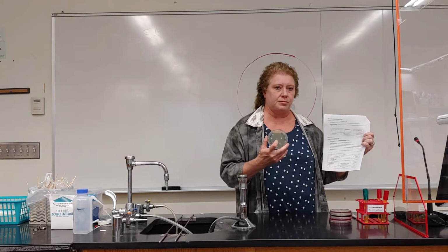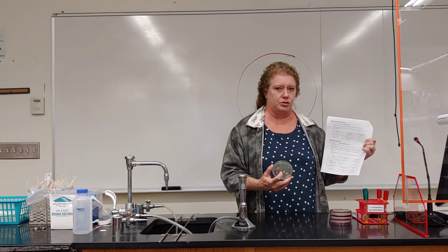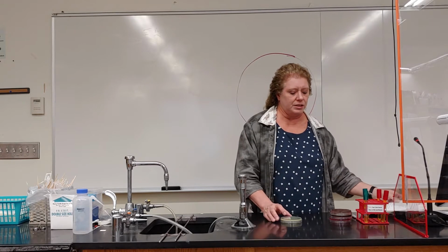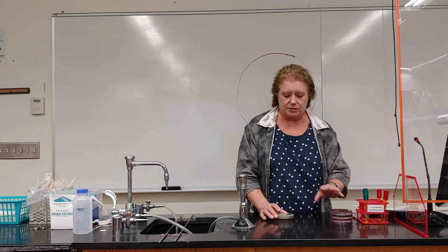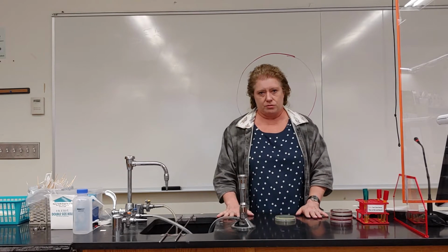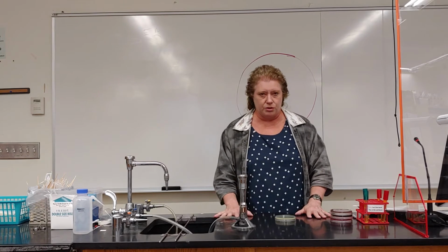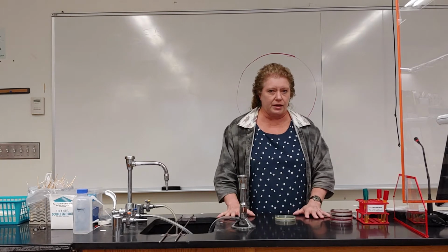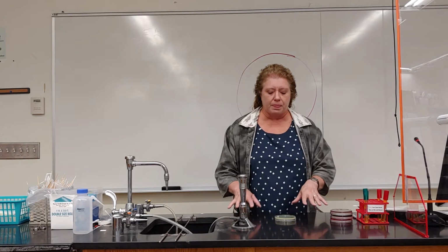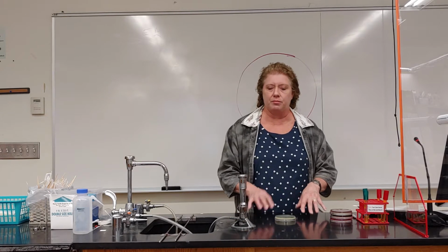This particular media is only selective. It is not selective and differential. So what does that mean? There are selective ingredients in all 4 of these media. The selective ingredient will either allow growth or not allow growth. So it's a yes or no answer. There's growth or there's no growth. And just that answer can tell you a lot, which we'll learn in these tables. But the selective ingredient is what gives that media the ability to do that.